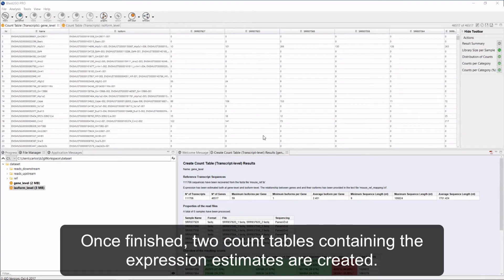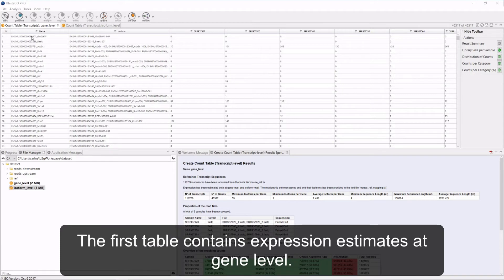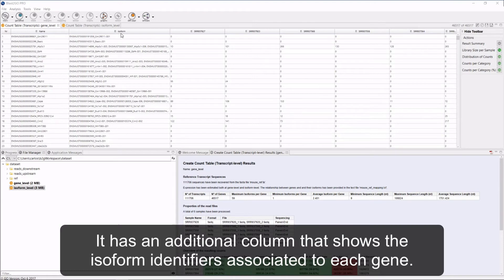Once finished, two count tables containing the expression estimates are created. The first table contains expression estimates at the gene level. It has an additional column that shows the isoform identifiers associated with each gene.